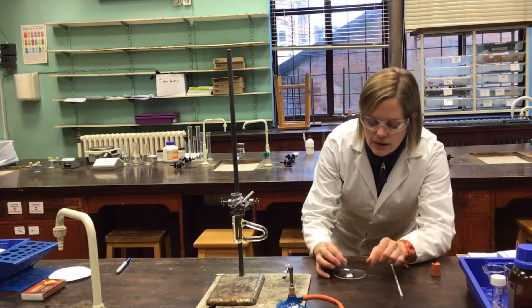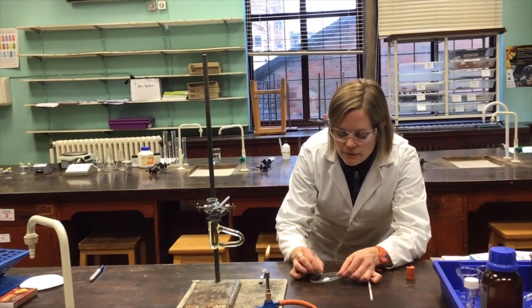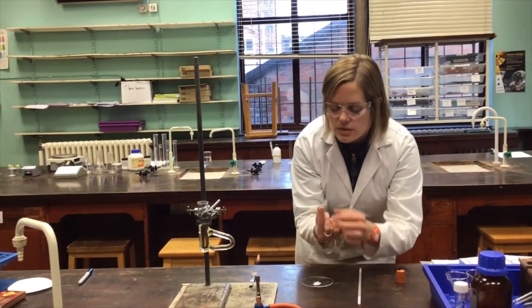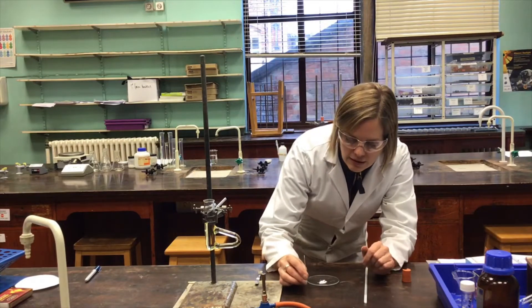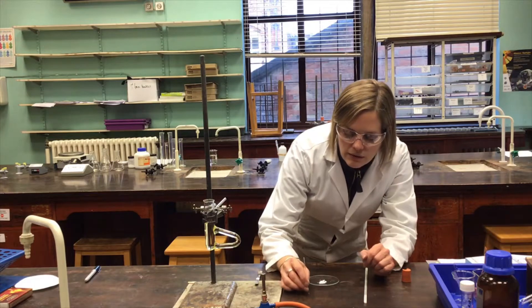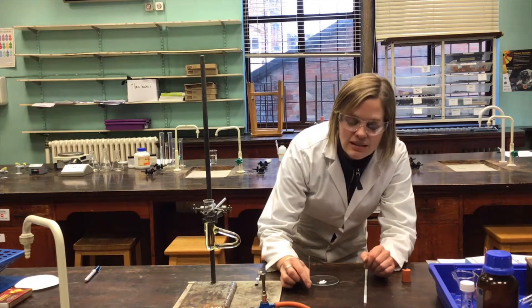I'm going to very carefully take the watch glass and tap the edge of this melting point tube into the sample. We start to get a little depth of the sample at the top of the tube. If I give that a little tap on the desk, it will gradually start to move down the tube. This is an exercise in patience, so come back in a few moments when I've got the sample in place.